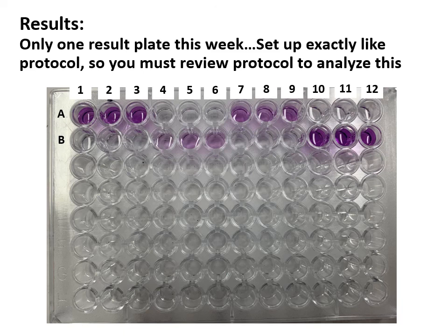A novobiocin disc without a zone of inhibition, what does that tell you? So don't just focus on background information, but be able to understand some results as well. Even things like the temperature experiment and the salt experiment. We had specific bacteria we worked with that should stick in your mind: Staph versus E. coli in the salt experiment, Bacillus, Serratia, and E. coli in the temperature one.